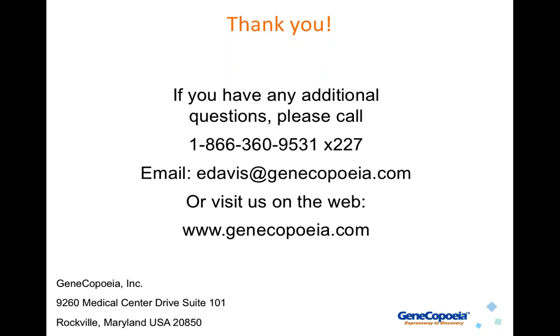Okay, next question. If I want to do a point mutagenesis to, say, constitutively activate a transcription factor, is there an advantage to using CRISPR over a standard method? And what is the workflow? Does the guide RNA incorporate the mutation? No, the guide RNA does not incorporate the mutation. For that, you would use a donor, just like with any other homologous recombination application. And then you would just screen it in the normal way using an oligonucleotide.